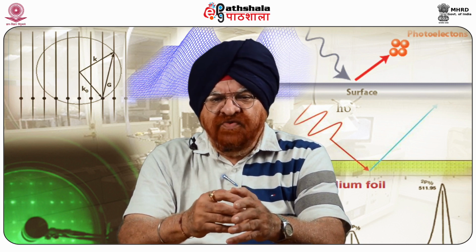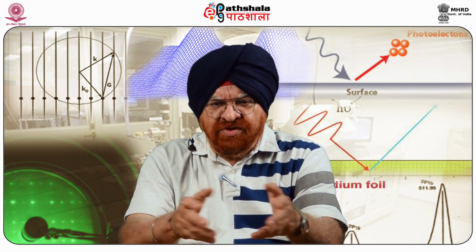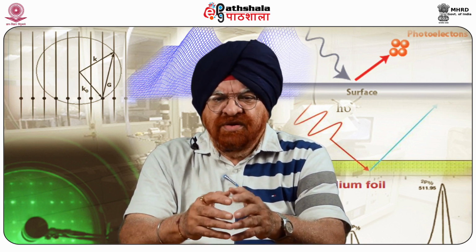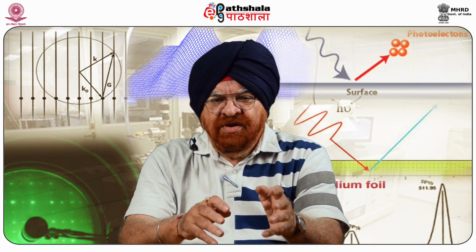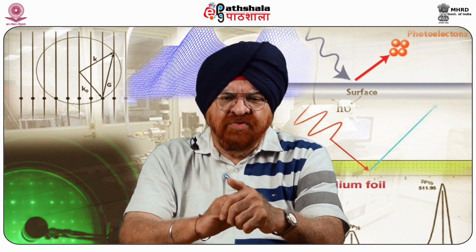So possible interactions are primarily the excitations of the vibrations of adsorbate molecules on the surface, vibrations of the upper layer of the substrate, that is surface phonons, and vibrations of the electrons in the substrate or in films of the substrate on the surface, and this is what is referred to as plasmons.